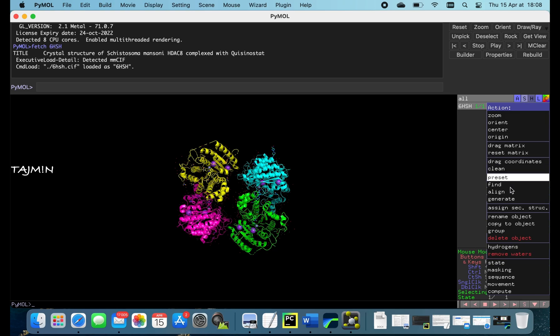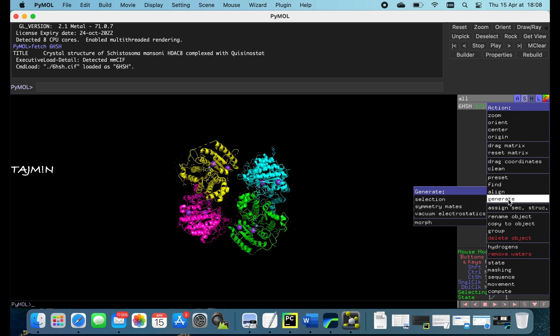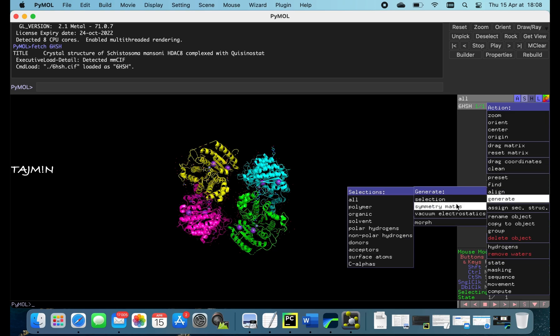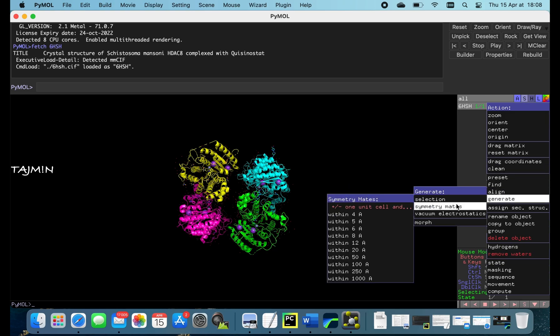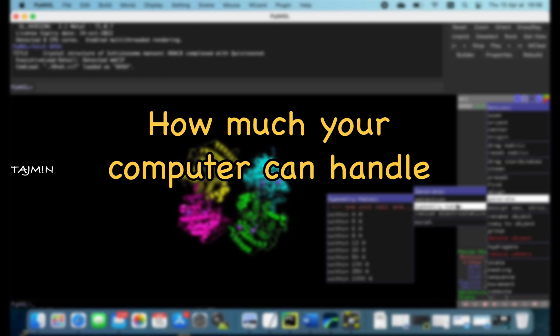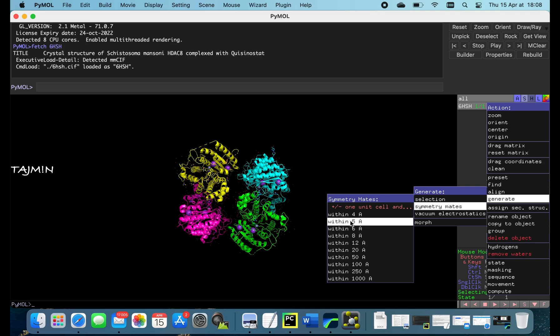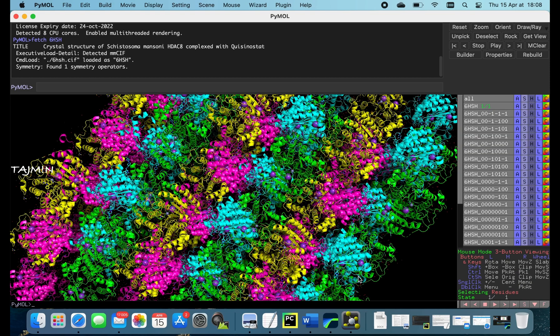To demonstrate the power of MacBook let me generate symmetry mates. So interesting question: How many angstroms can your computer handle? 8, 12 angstroms maybe? But here I go and generate 1000 angstroms directly.